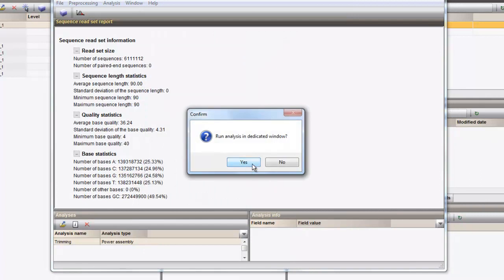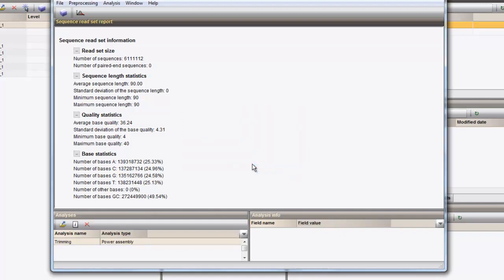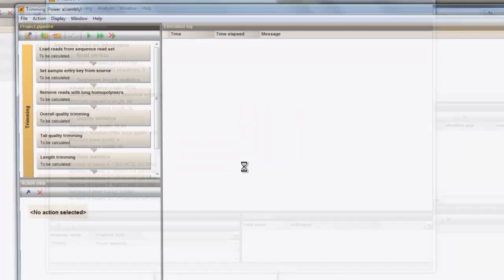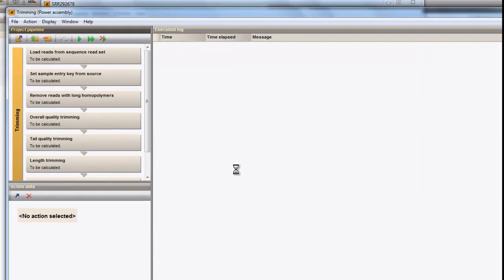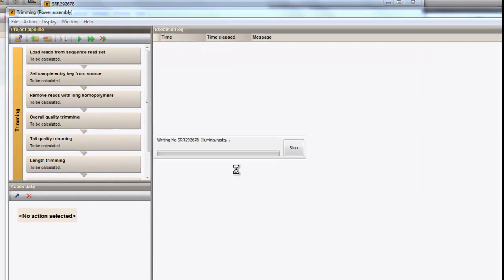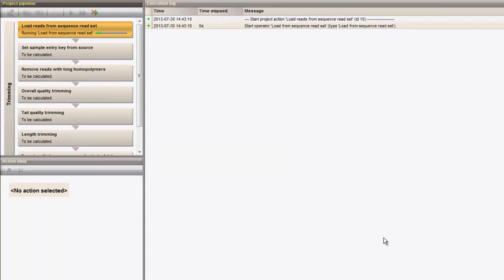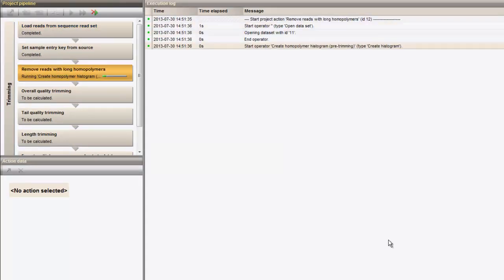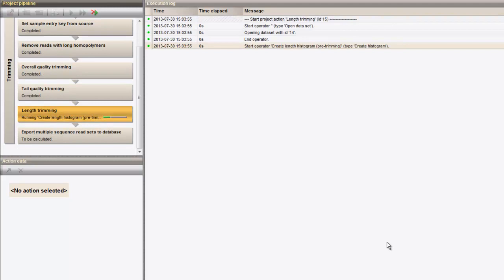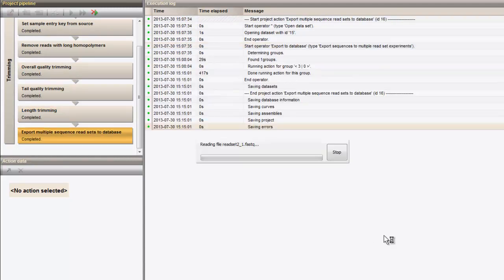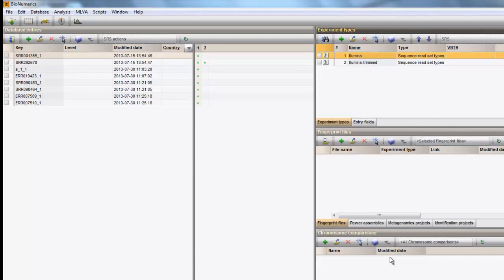By clicking Yes here, the power assembly window will open. After confirmation, the trimming pipeline is built up and executed. Once the calculations have finished, the resulting dataset is saved to the database.